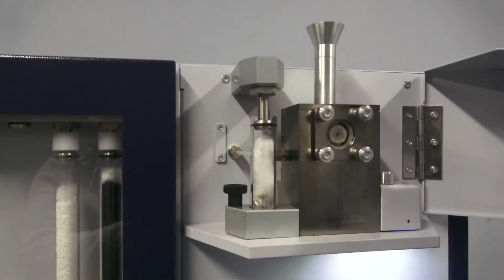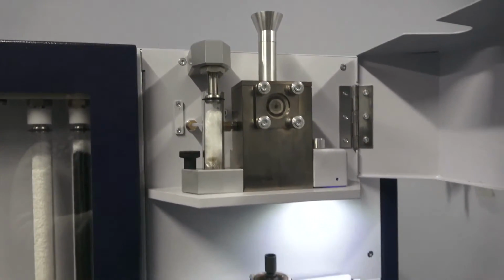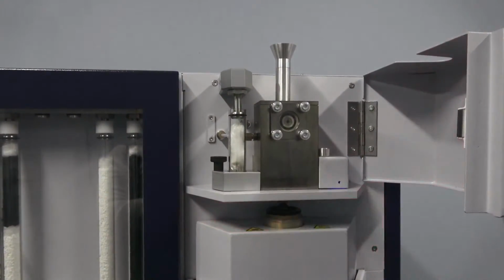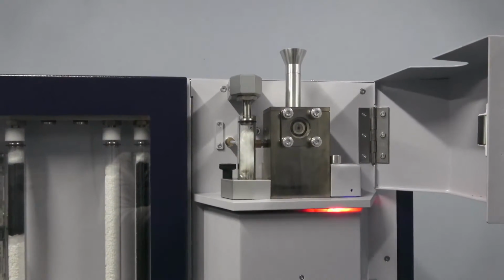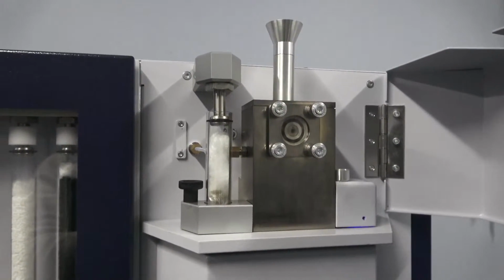I will start the analysis now. And the crucible carrier will go up. As you can see, it will go up. That's loading it up into this little chamber zone. When the time comes, that loop will rotate and will drop the sample into the hot crucible. So right now it's heating up.